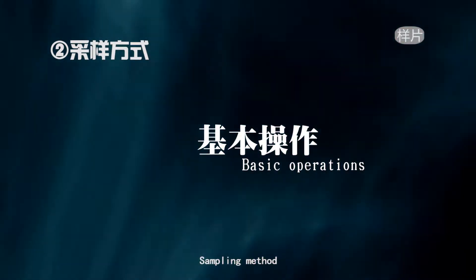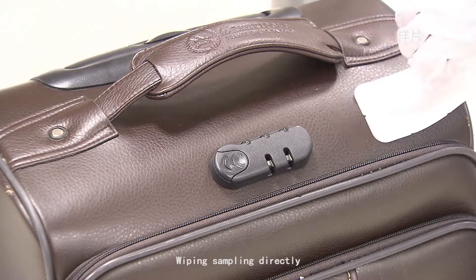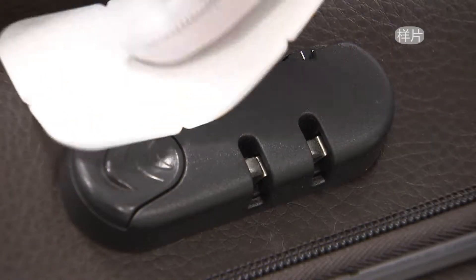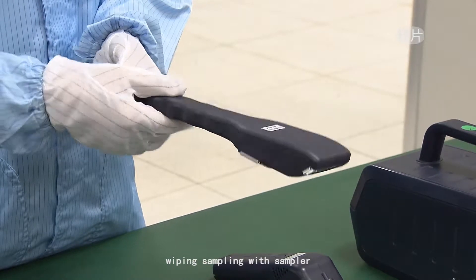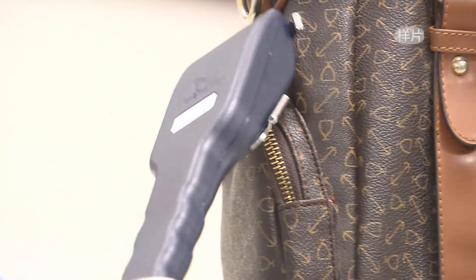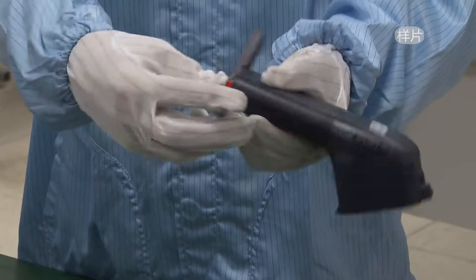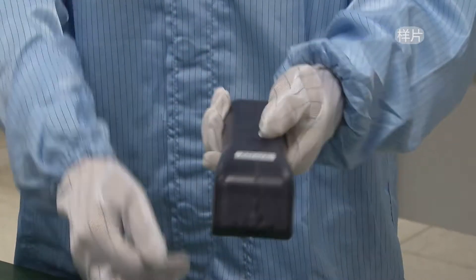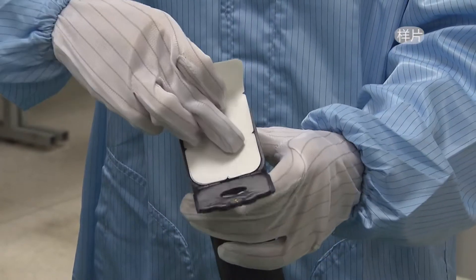Sampling methods: wiping sampling can be done directly, or wiping sampling can be performed using the sampler.